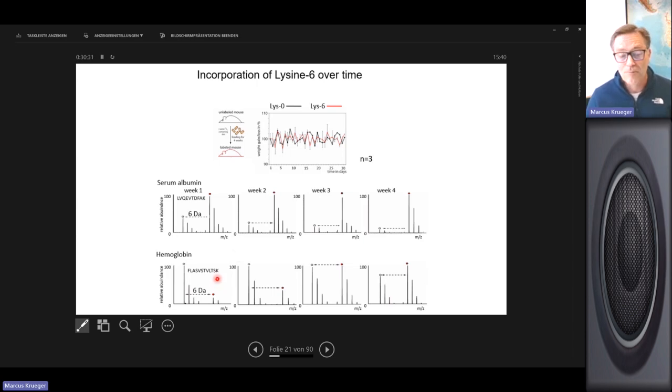Yeah. So one has to take care which tissue and which cell type you analyze, because these turnovers are not only associated with the endogenous turnover or stability of the protein, but also with the half-life of the cell. So if the cells will divide, or will be degraded or depleted, then of course you will also lose that protein, and might get another turnover.